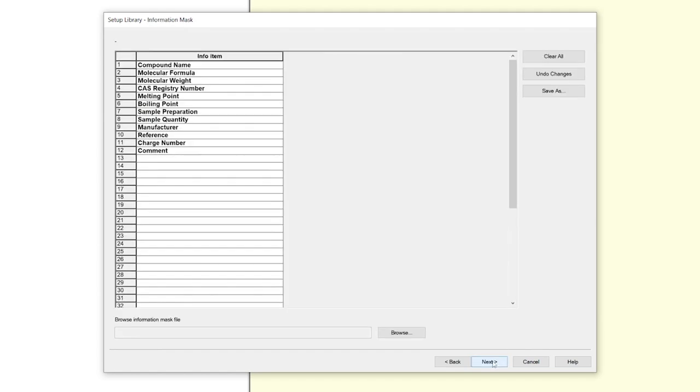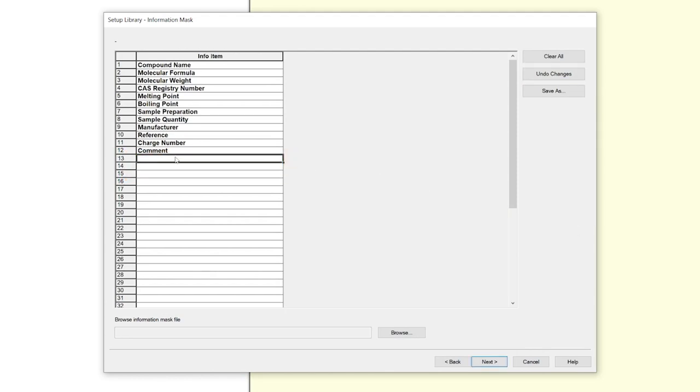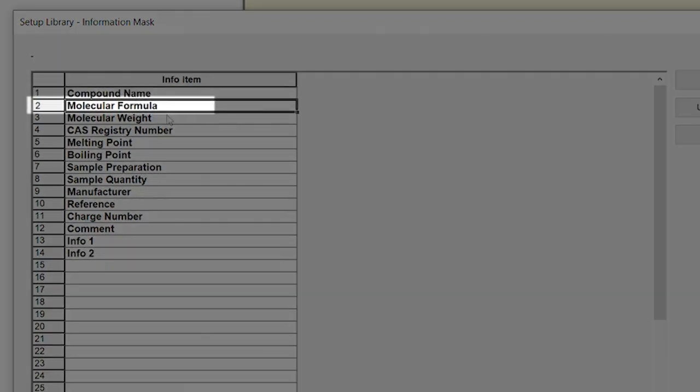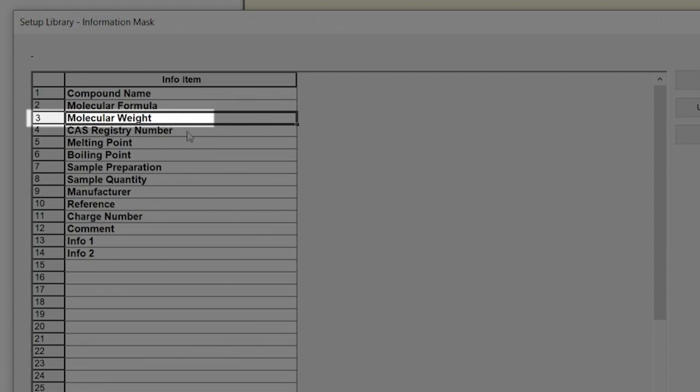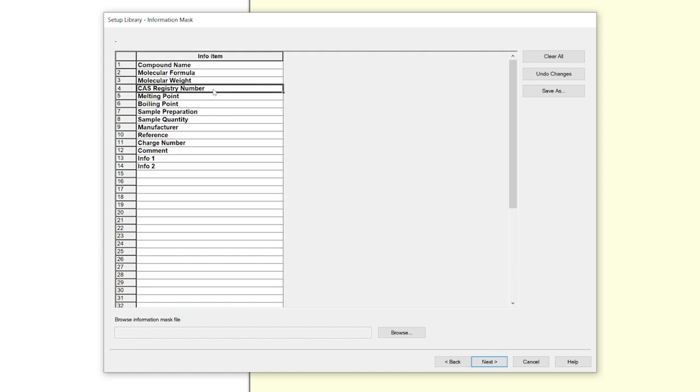Now you define the information mask, the additional information your library will contain. You have multiple options. You can manually add info items in the table. Just click at a cell and enter the wanted information. Pay attention that your first four entries must be compound name, molecular formula, molecular weight, and CAS registry number.